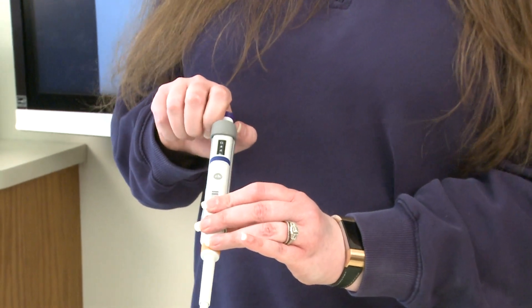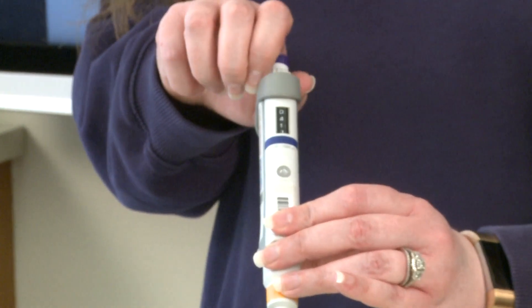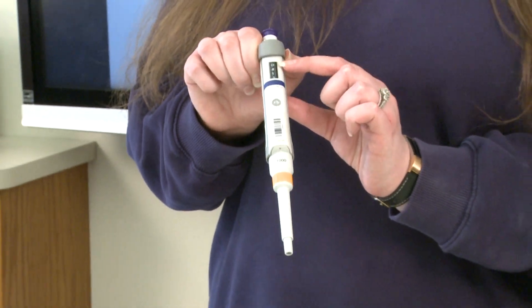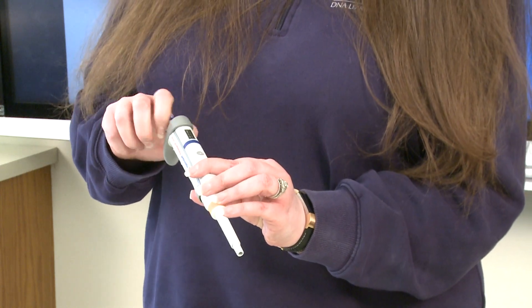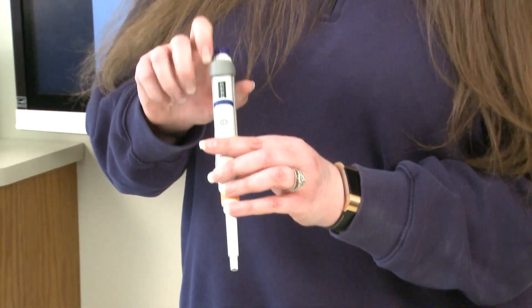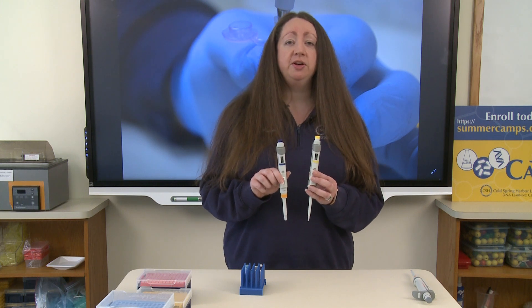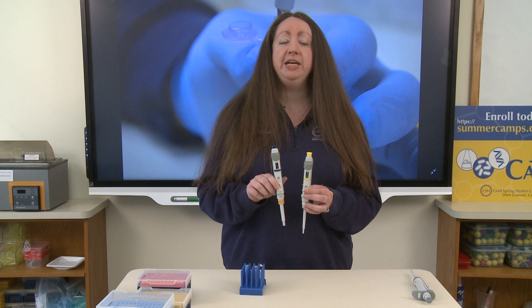This dial on the top — if you spin to the right, the numbers will go down; if you spin to the left, the numbers will go up. This volume goes up to 1000. So to set this for 250 microliters, we need this window to read 0250. If we were to make our window on the yellow pipette read 0250, that would not be 250 microliters — that would in fact be 25 microliters.